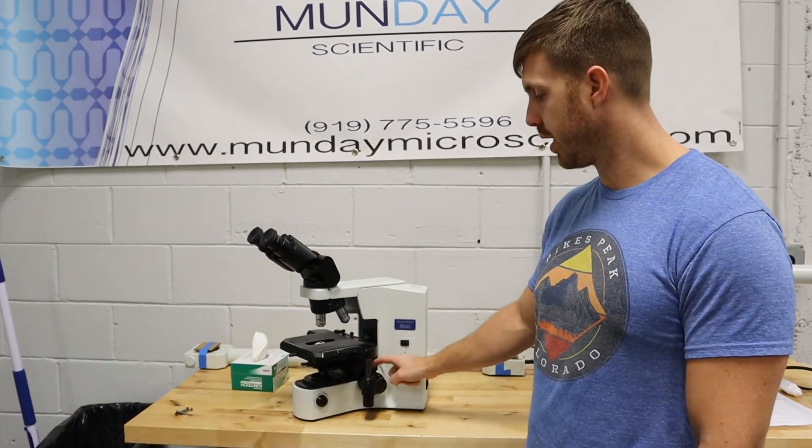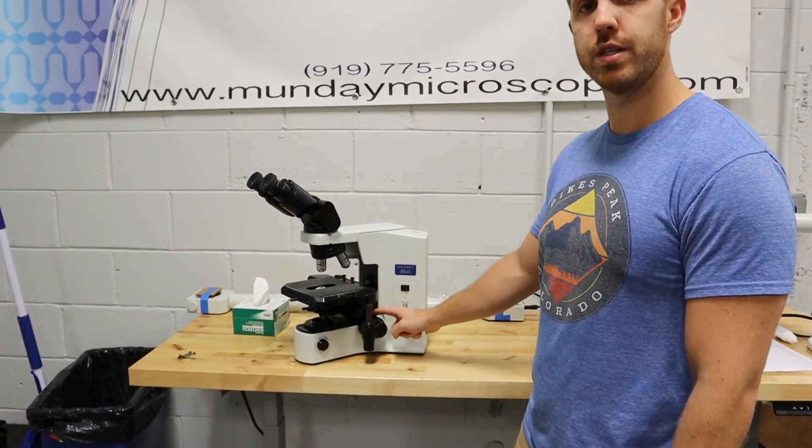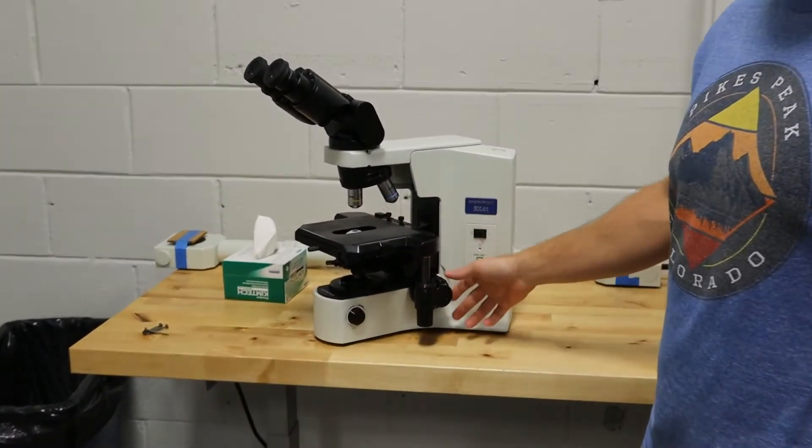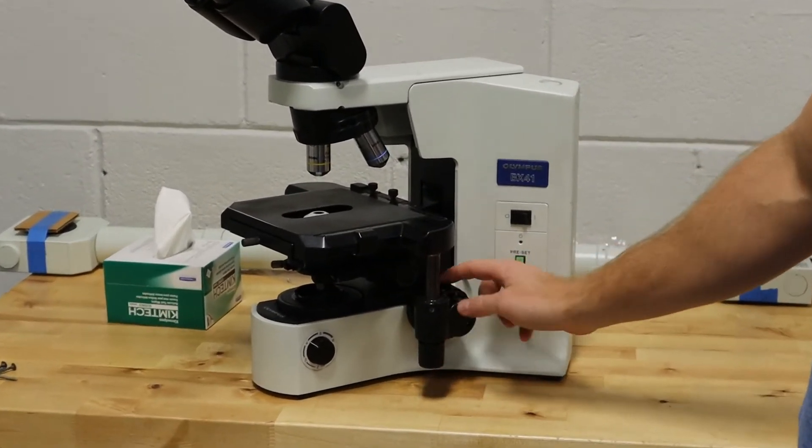This tension ring right here could be adjusted on the Olympus BX or SZX, IX, it's all the same.